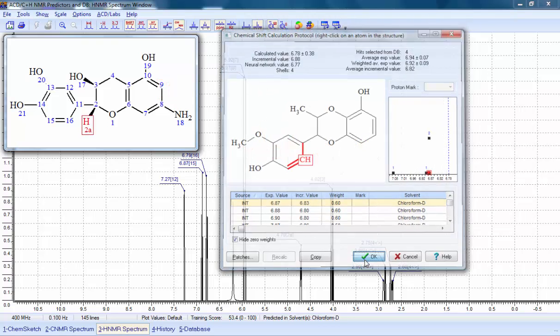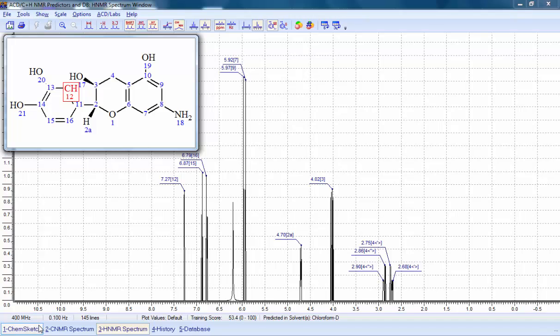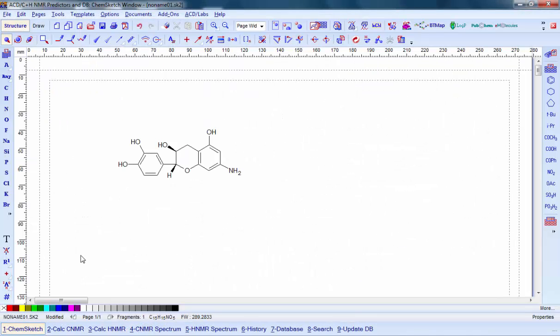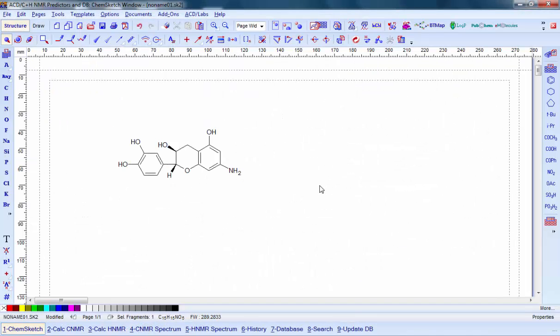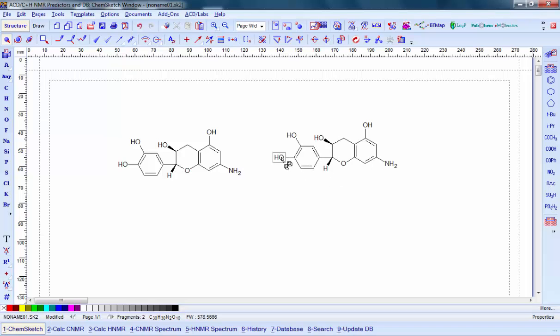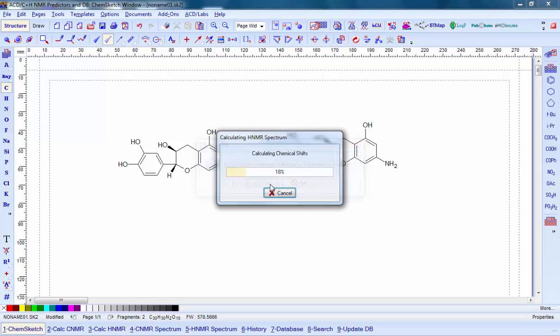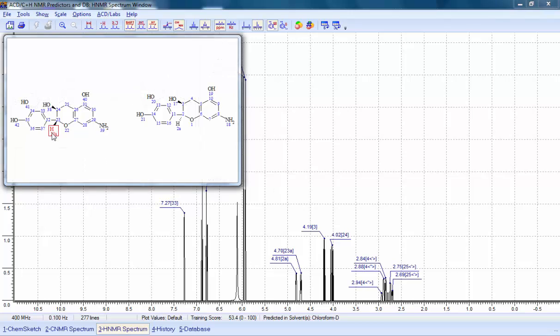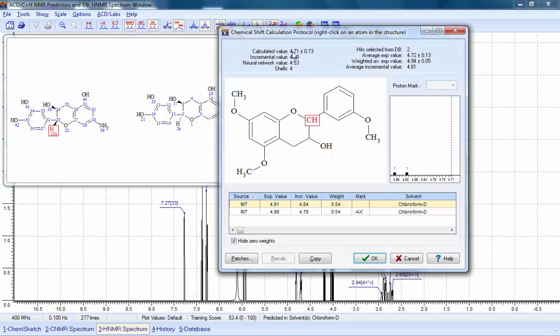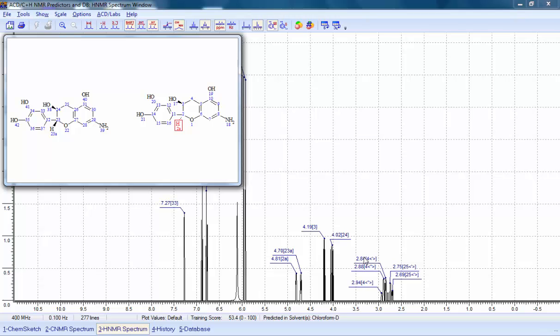What if we want to predict the spectrum for a mixture? We can simply go back to the ChemSketch interface and add a new structure alongside the existing one. A quick change to the stereochemistry, and we're ready to recalculate. Now we have a complete spectrum for the mixture of both compounds, again showing the protocols for each predicted peak.